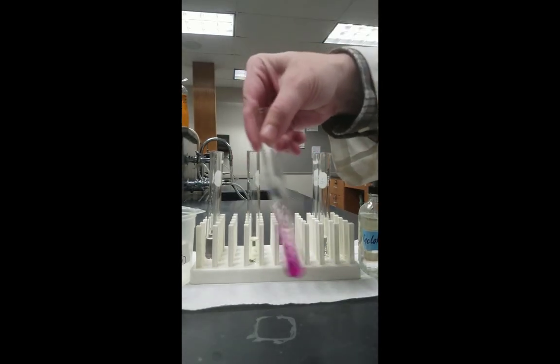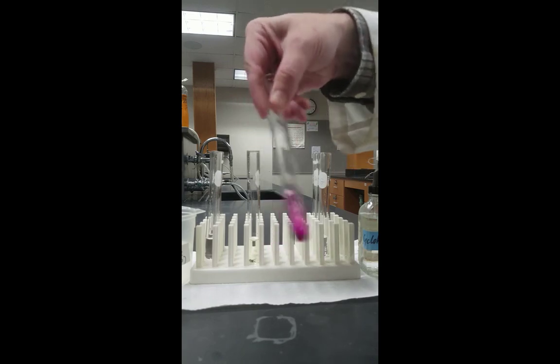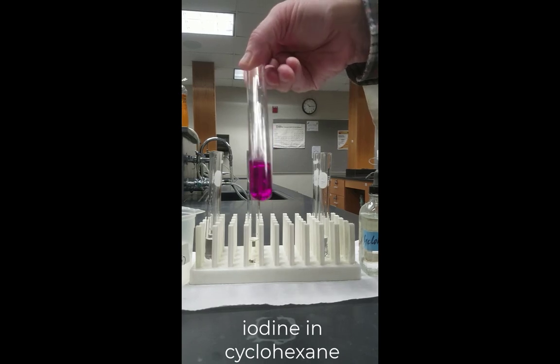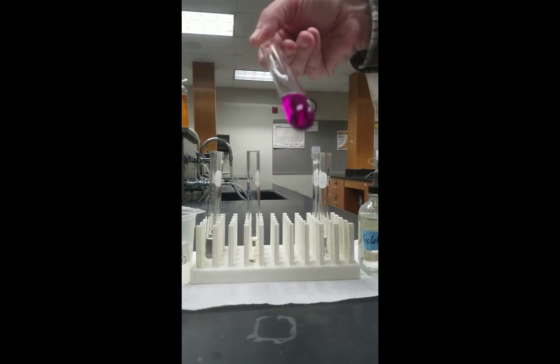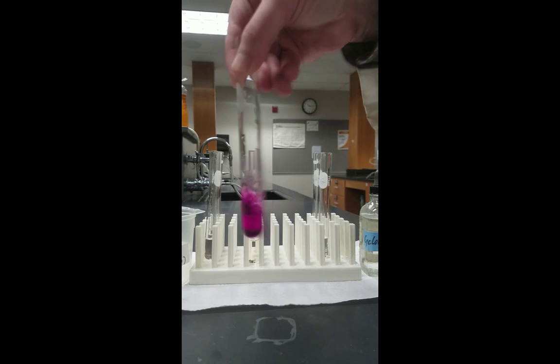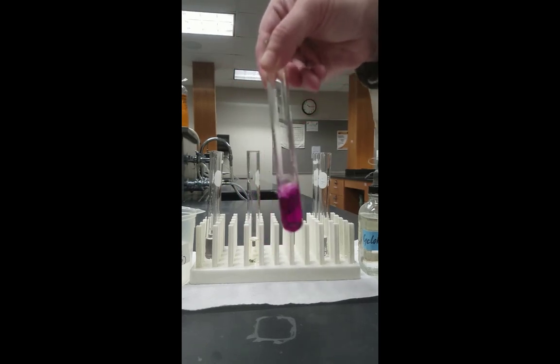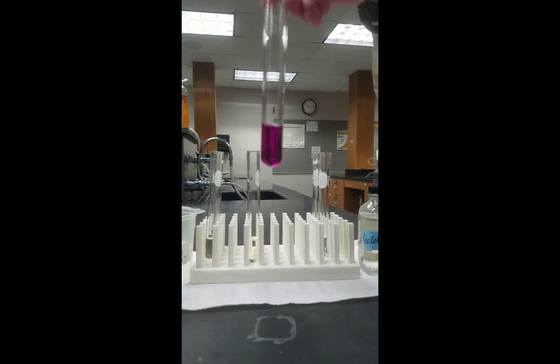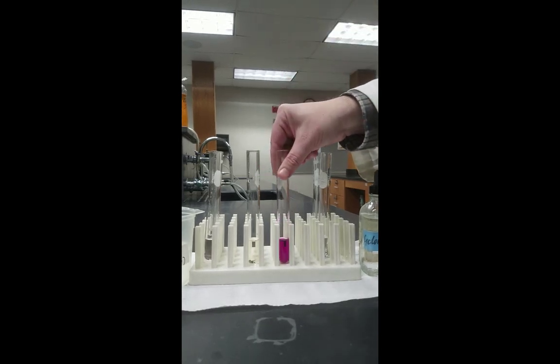On the other hand, when we shake the iodine in cyclohexane, it takes on a deep purplish color, just like the solid iodine had. If we look very carefully, it will appear that virtually all of the solid iodine has dissolved.